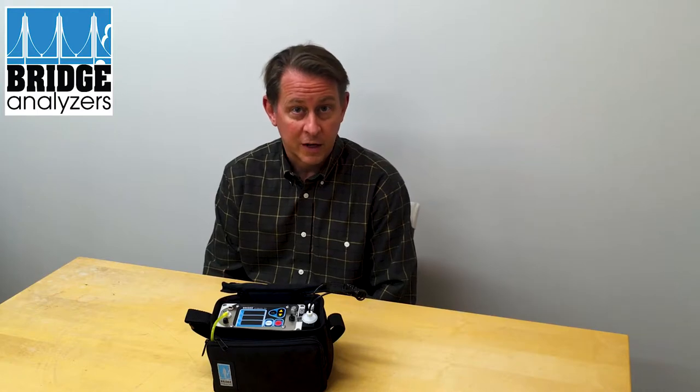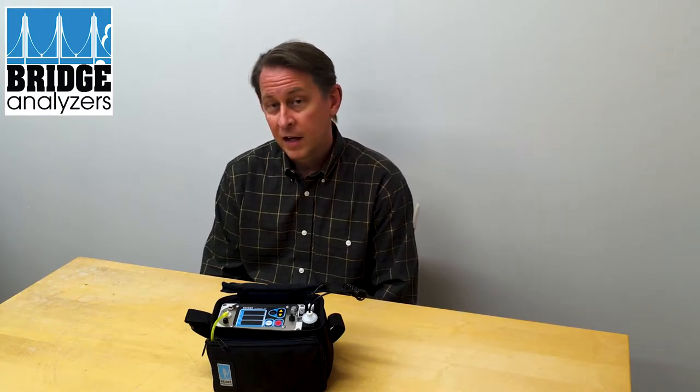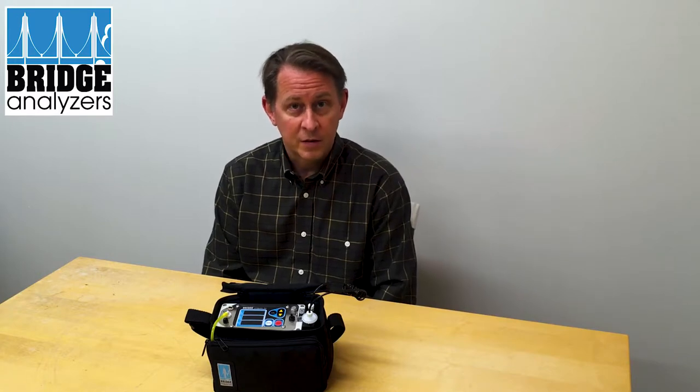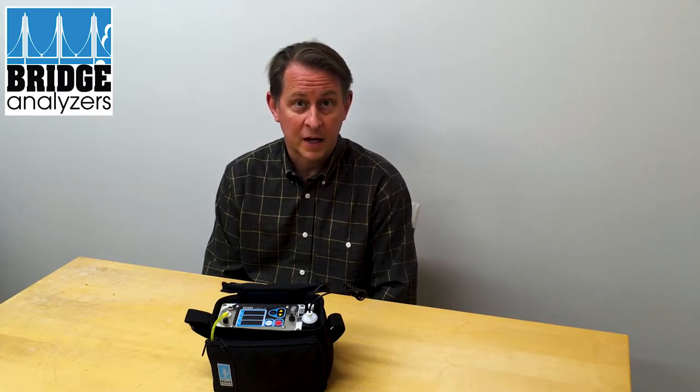This is what the customer was finding — that they'd be fine in the morning, and then as it got to be midday or afternoon, they would start to see stability problems on the oxygen sensor.